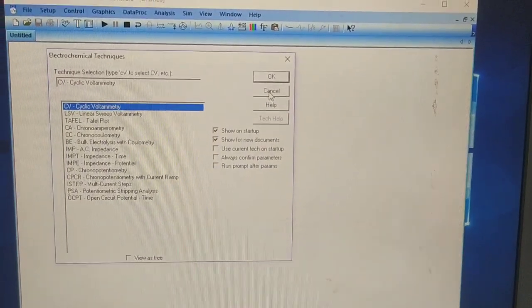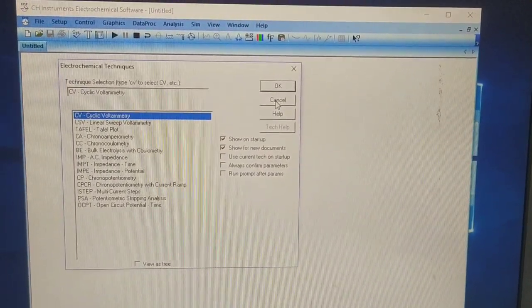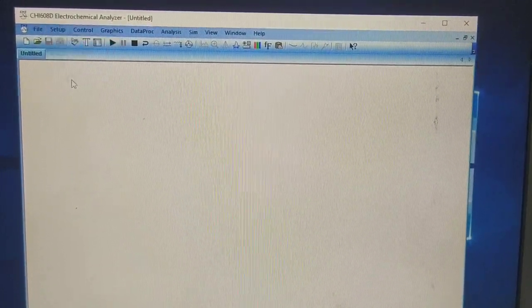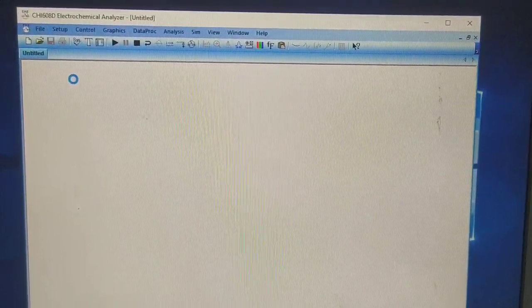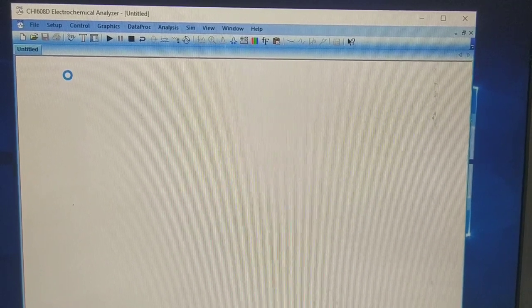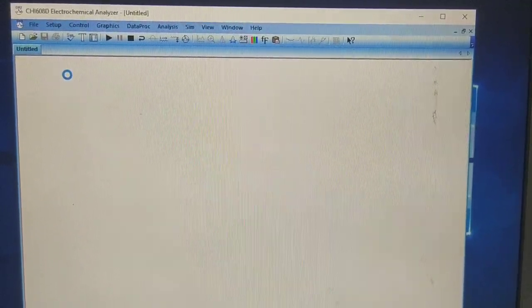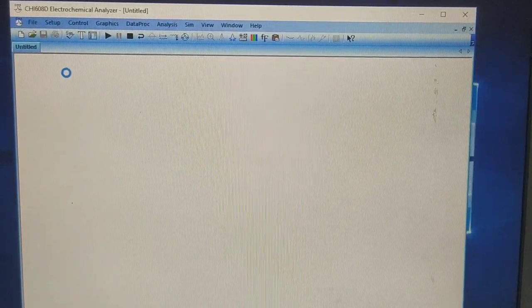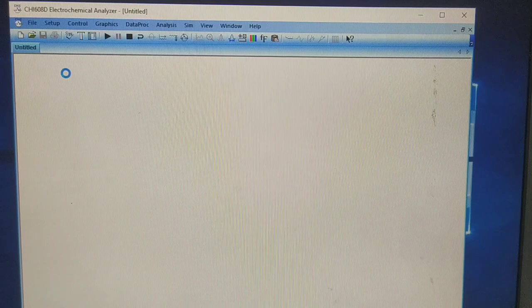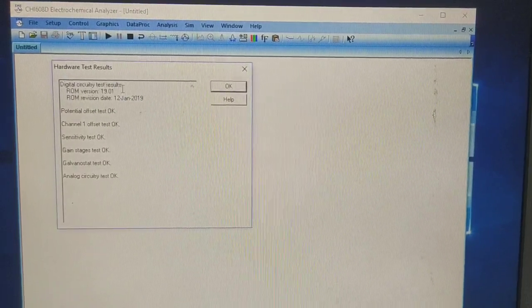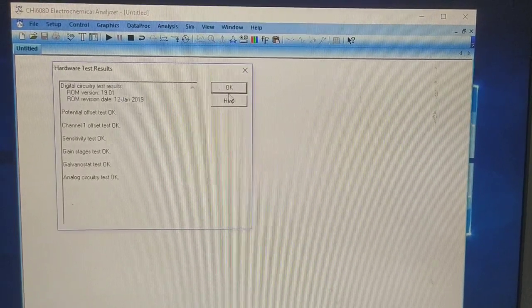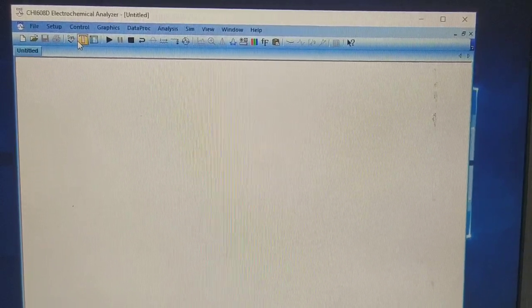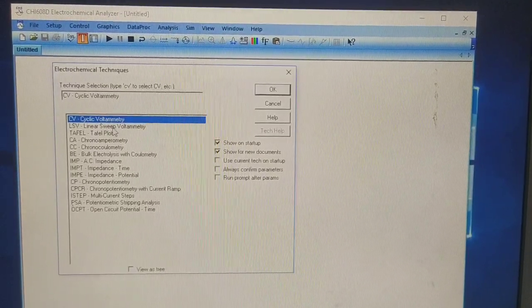Let's open the CHI software first. You will see this window — just cancel this and go to setup. First we need to do the hardware testing. A window will open and you can see all are OK here, then press OK.